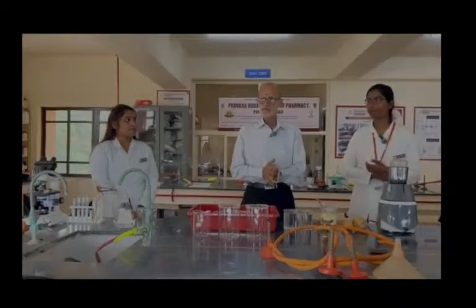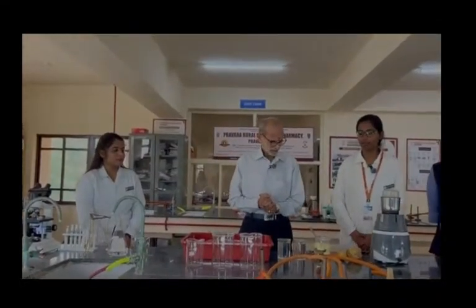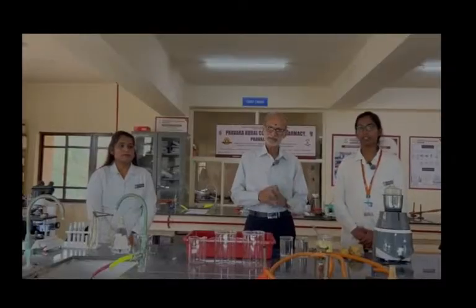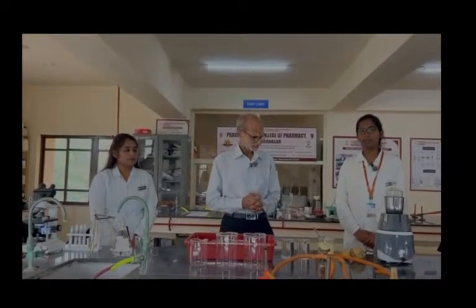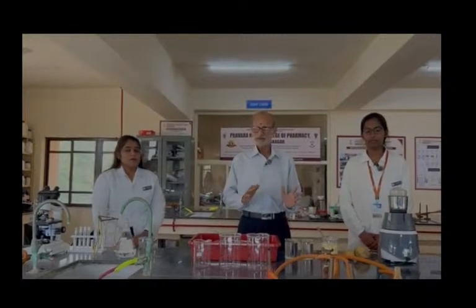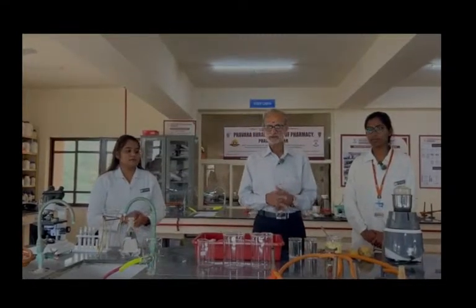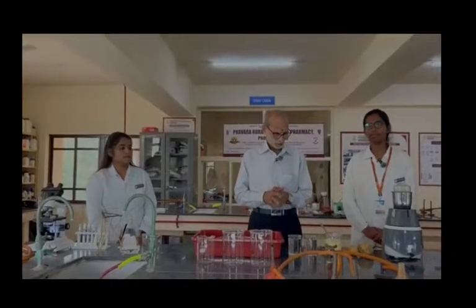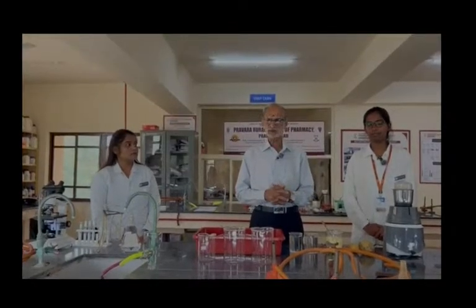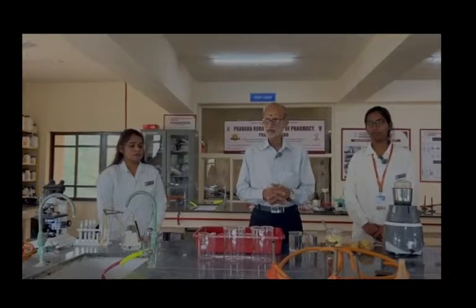We are going to begin with the very first experiment, that is separation of starch from potato. Let me give some idea about the starch. Starch is extensively used in the industry, whether it is food industry, pharmaceutical industry, textile industry, or the paper industry. So starch really has good importance in society. And we are going to begin. There are three important starches. Number one, and most widely used, is corn starch. Number two is potato starch.